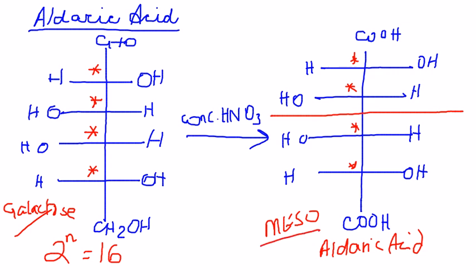So what should you get in the optical rotation? A value of 0. So one way, and we are not going to follow that way, but one way that you could determine whether or not your reaction has gone through is you could use a polarimeter. You could get the optical rotation of the starting material, you could get the optical rotation of the product, and compare the two things.